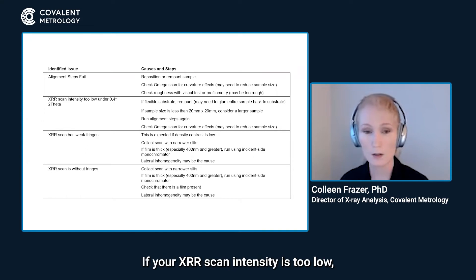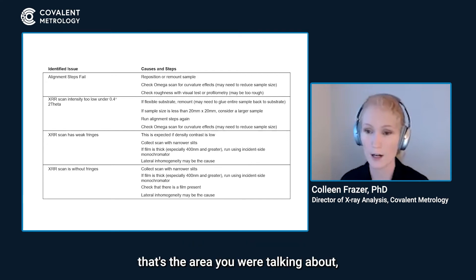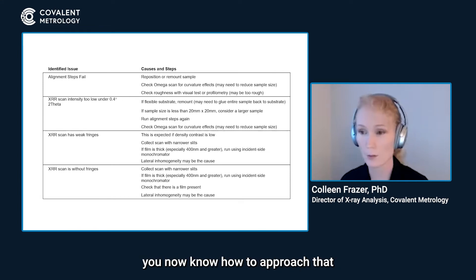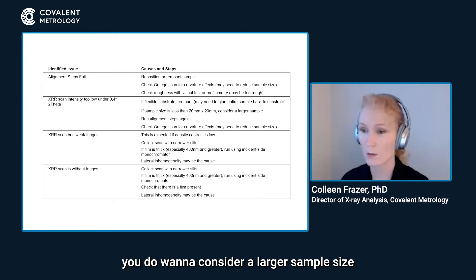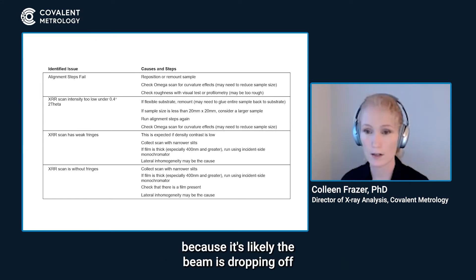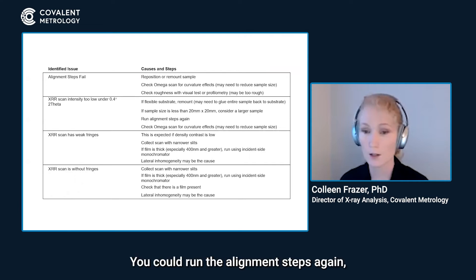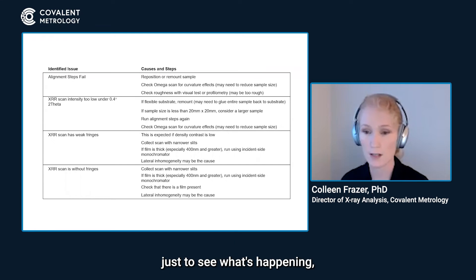If your XR scan intensity is too low under 0.4 degrees two-theta, which is usually around where the critical angle is, that's the area we're talking about. If you have a flexible substrate, you now know how to approach that and why you need to flatten it. If your sample size is less than 20 millimeters on a side, consider a larger sample size because the beam is likely dropping off. You can also run the alignment steps again as a first line of defense to see what's happening.